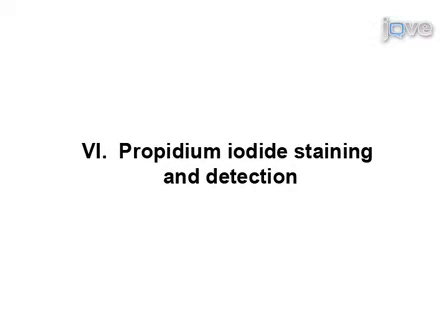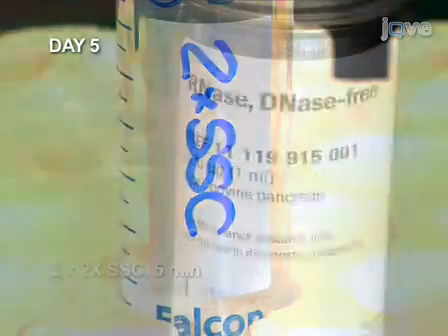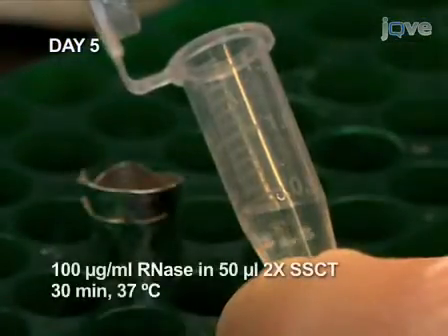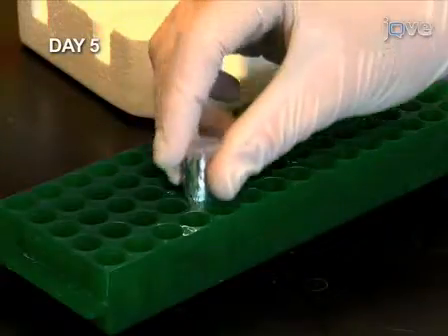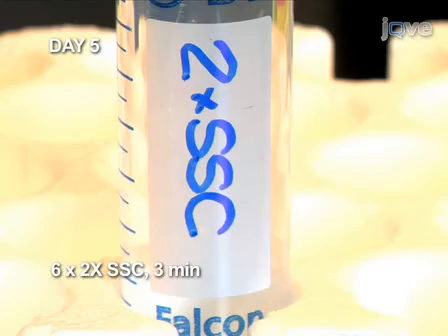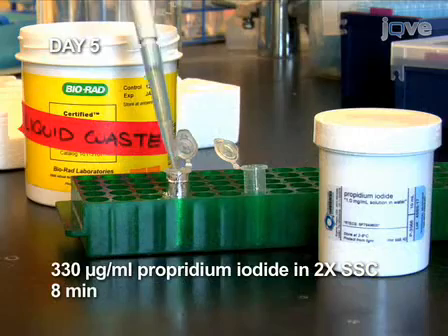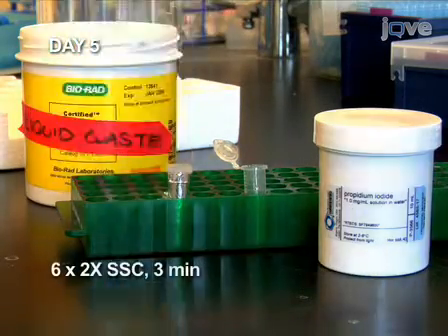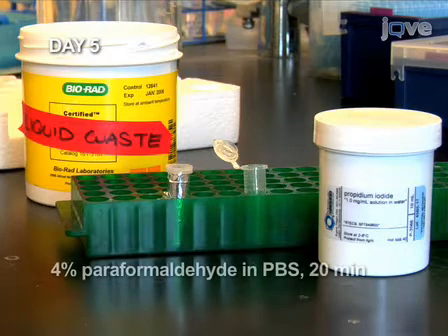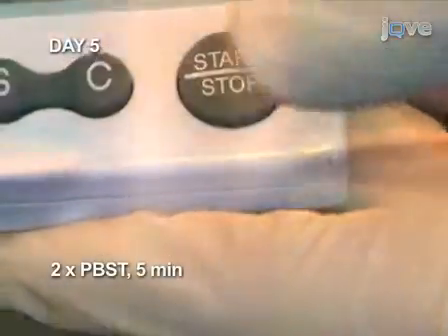A final staining step with propidium iodide marks the nuclei. Start with two 5-minute washes in 2x SSC. Next, treat with RNase for 30 minutes at 37 degrees, then wash 6 times in 2x SSC at room temperature. Add the propidium iodide solution and stain for 8 minutes, then wash 6 times in 2x SSC. Fix the embryos in paraformaldehyde for 20 minutes, and finally, two 5-minute washes in PBST.